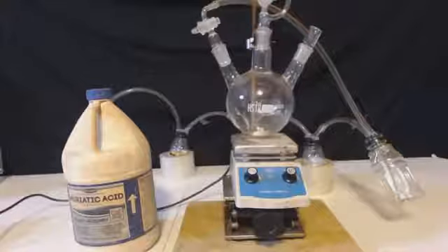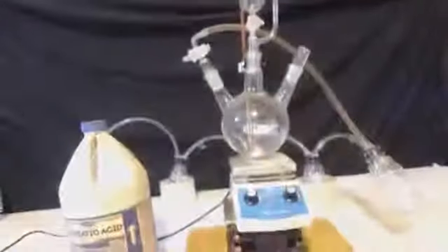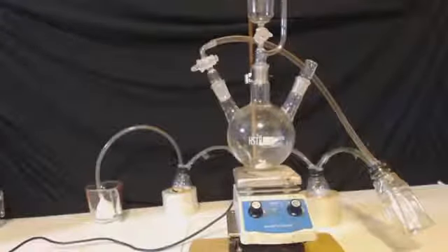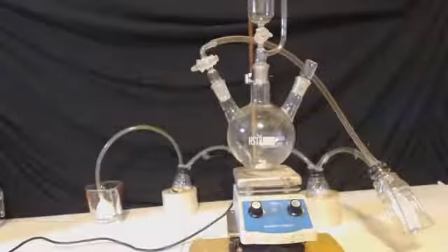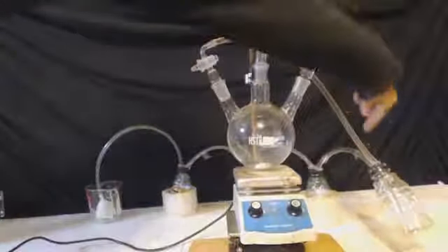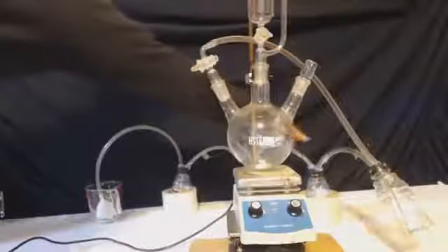We're going to make some chromium 3 chloride, or chromic chloride. There's my apparatus. I've got an equalizing funnel up on top that goes into a round bottom flask. As you can see on the left there, it's got a little valve that goes to a hose. And if you saw one of my previous videos called a gas scrubber, you'll know what it is.